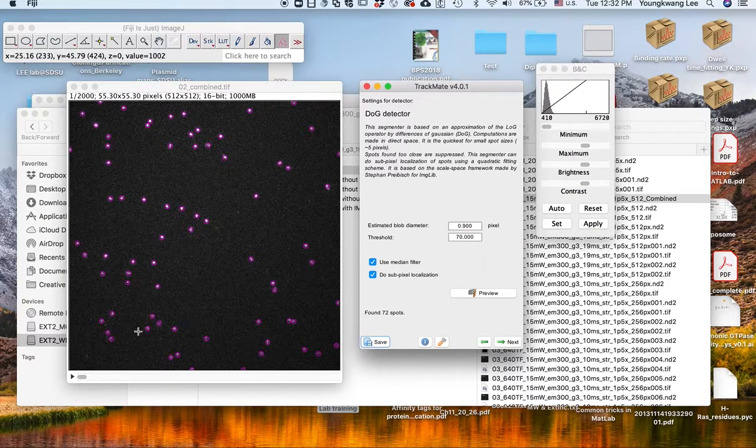70. You lose some particles over here. That's because the illumination at the edges is not as strong as the center. That's fine. You may increase this a little bit more. Okay, so still it holds 22. So you should be able to see some range of the threshold which does not really change the number of detected particles. I like around 100 for this image, I think.